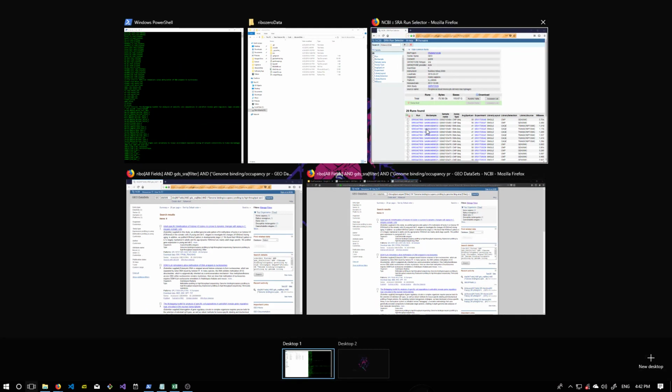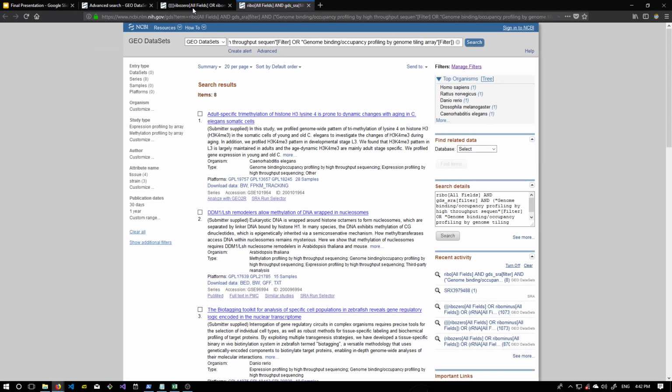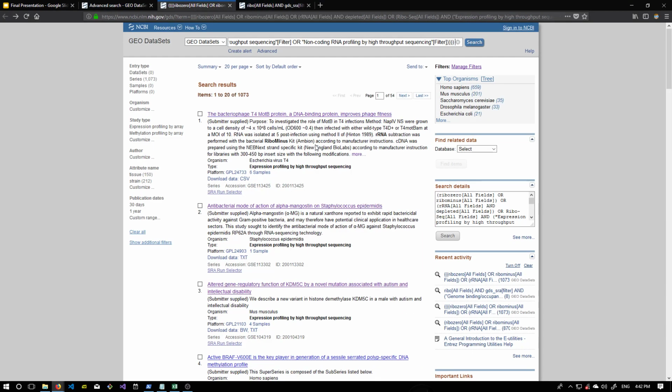While this is going, I'm going to show you what we are scraping, just to give you an idea of how we're doing it. We get to this base page and we scrape all of the article titles and then the hyperlink that each article title goes to. We copy the GSE right here, and we use that as the parent folder where all of the SRR files will be stored to help group them together. We'll see this in a bit when I show the Excel that's created. This ID is the one that's stored in keys.txt, so that we don't repeat the scraping of the same article.